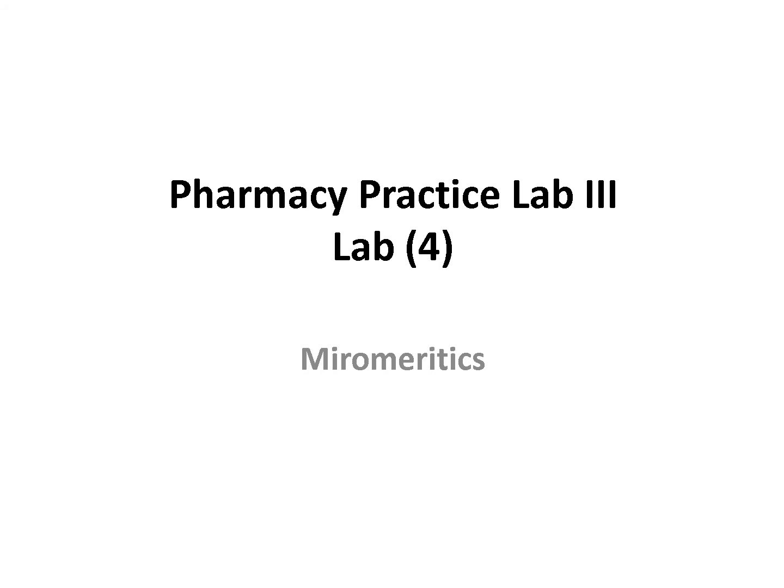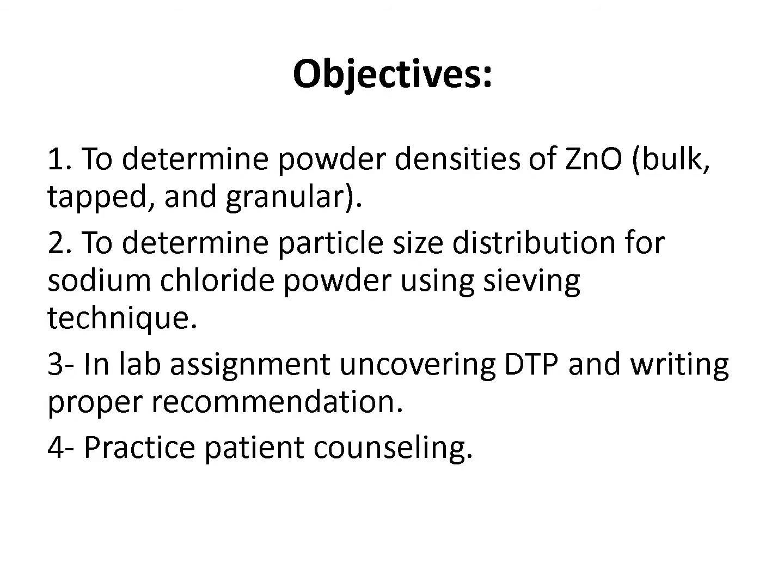We will talk about micromeritics. What micromeritics really is, is the science and technology of fine powder. Pre-formulation tests are done on powder or granules in order to put them in a solid dosage form or in suspension.